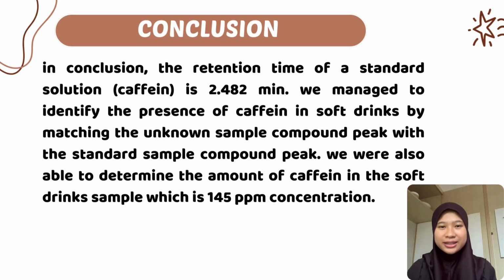In conclusion, the retention time of the standard solution, which is caffeine, is 2.482 minutes. We managed to identify the presence of caffeine in soft drinks by matching the unknown sample compound peak with the standard sample compound peak. We were also able to determine the amount of caffeine in the soft drink sample, which is 145 ppm concentration.